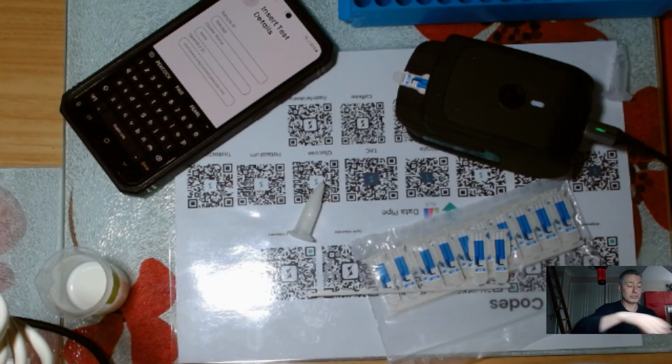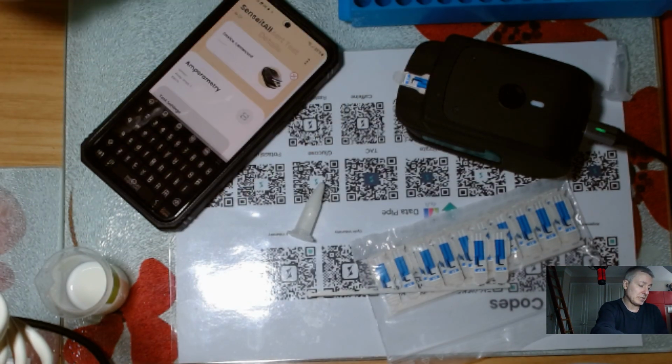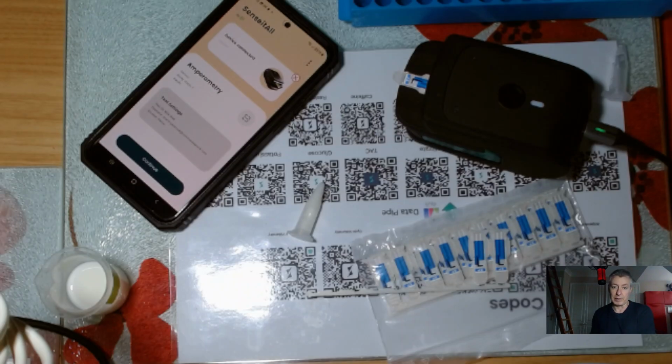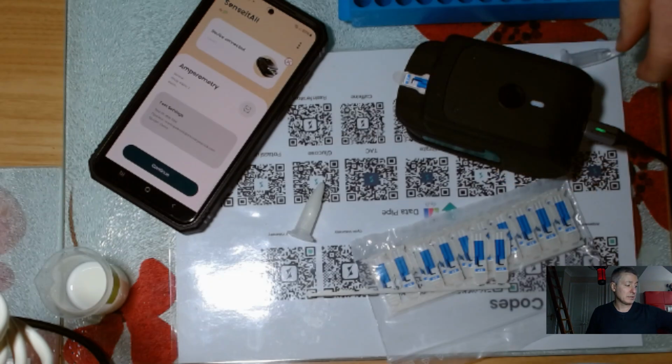In the right applications, you could even say a minimally viable product really quickly. One of the big problems in biosensing electrochemical assay development is people spend a lot of time reinventing the wheel. We've built a platform that independent developers can come upon and start developing their own assay.